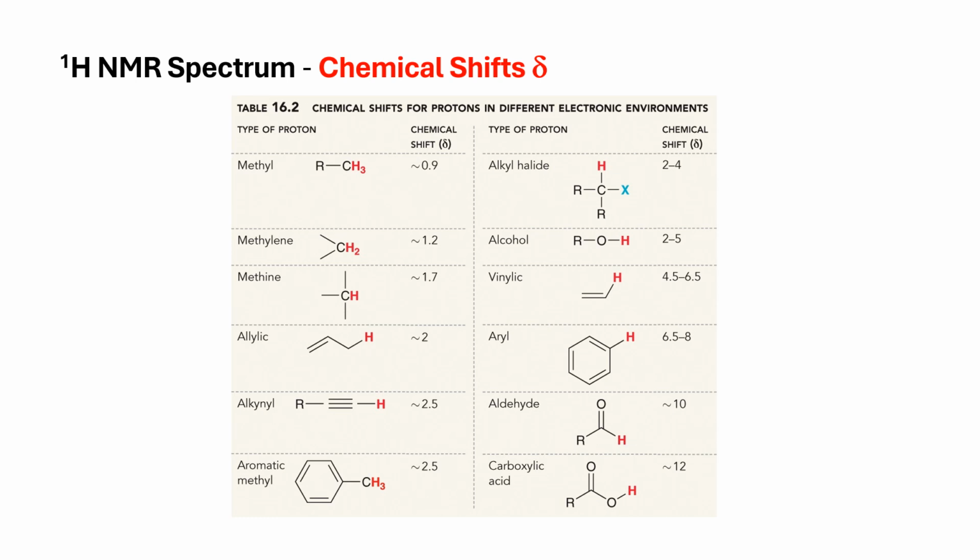Aromatic between 7 and 8, that's something important. Alkyl, methyl and methylene, these are at higher field. Notice that, upfield. And allylic, as you have here in the methyl here, we consider the phenyl ring as an electron withdrawing group. That's why these are lower field than the methyl here.